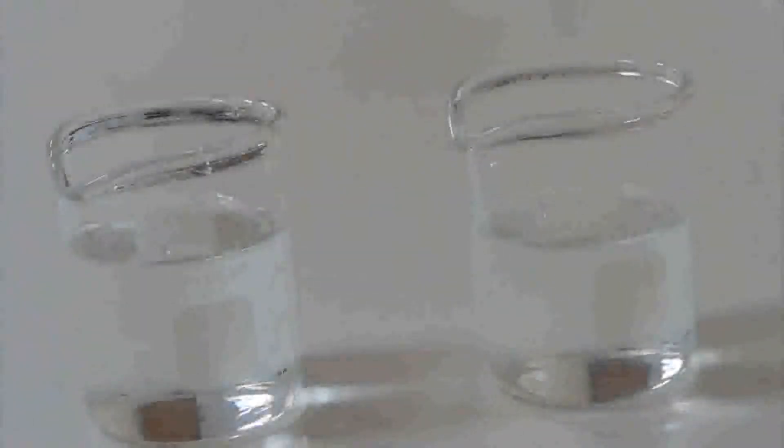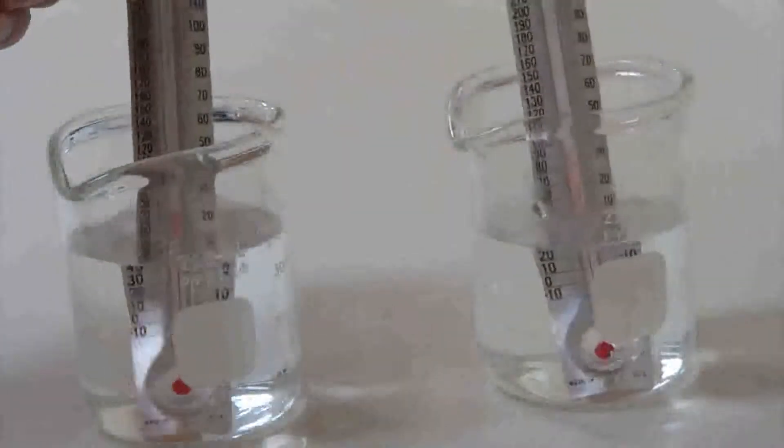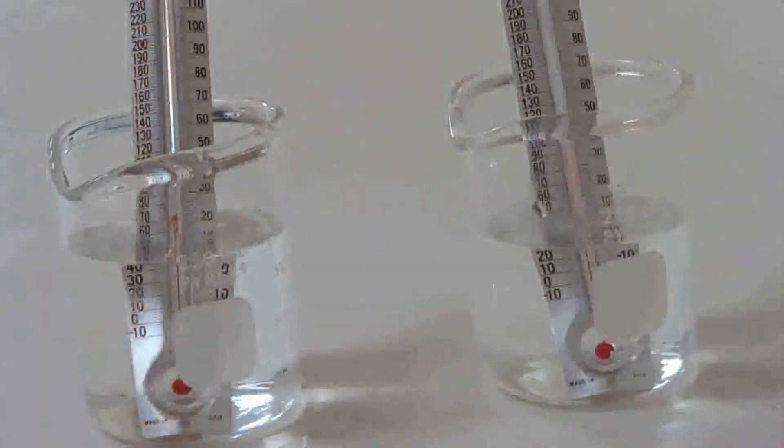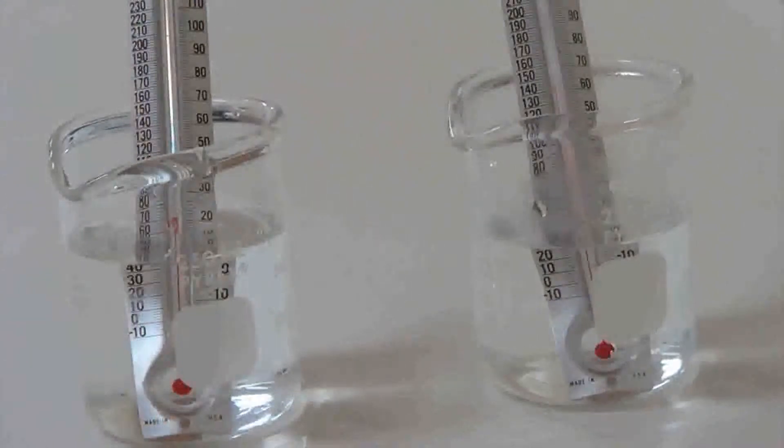A big concern with glassware is that once you heat a liquid in a glass container, that glass container looks just like it did when it was cool. There's no way to tell just by looking if a glass container is going to be hot or cold. You're now looking at two glass containers filled with liquid. Tell me which one is hot and which one is cold. Well, there's no way to tell without adding thermometers. So let's add them and see what we can find.